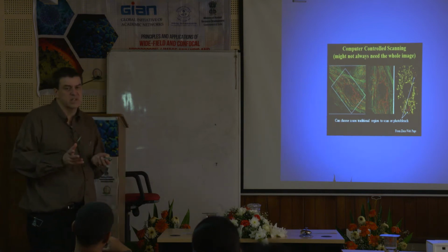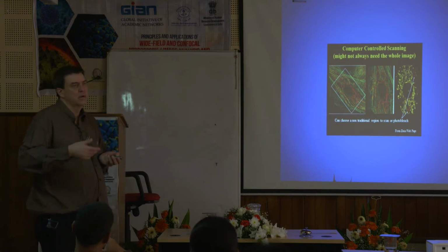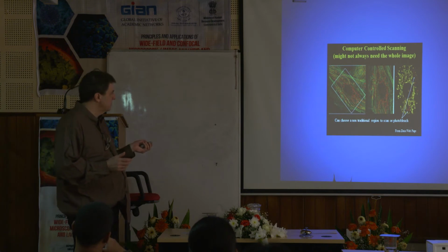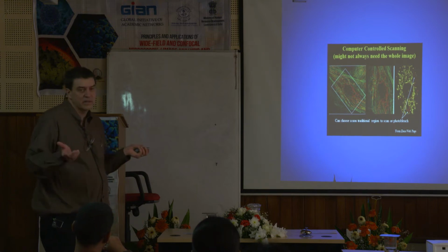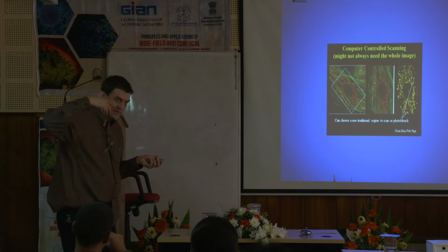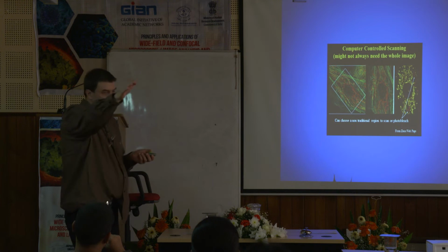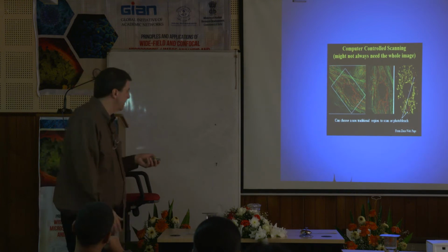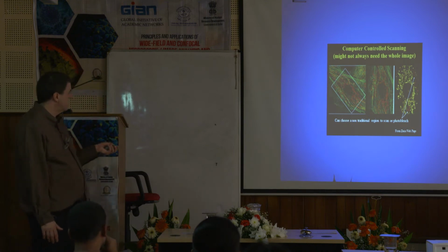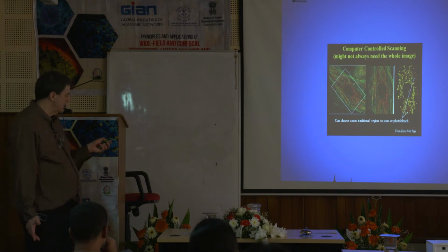Because laser scanning can be a little slow at times, and we'll talk about averaging in a little bit, and it slows it down a little more. And so again, if you're just looking at the nucleus, why would you take your time and take pictures of stuff way out here that's irrelevant to what you're doing? Okay. So another thing to think about, just take the image of what you need instead of just blasting away with lasers to hurt the specimen. Okay? And again, to avoid photo bleaching or to avoid phototoxicity.